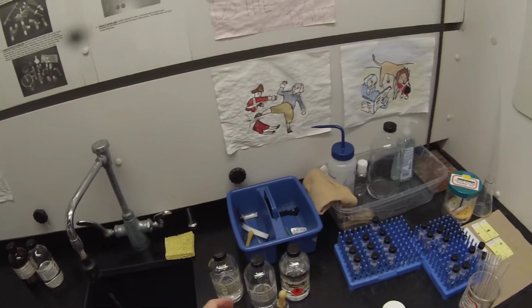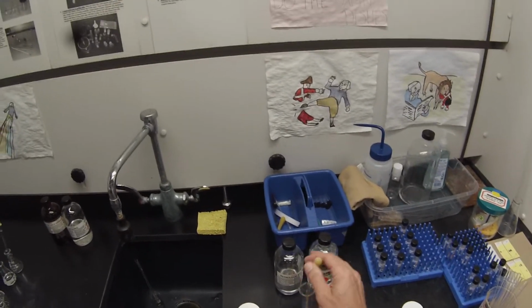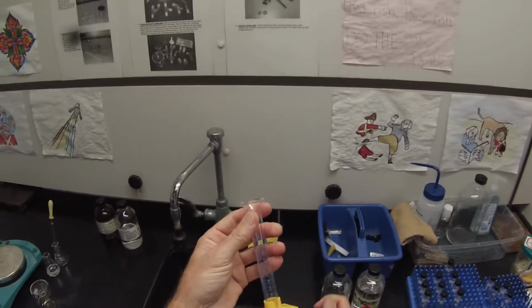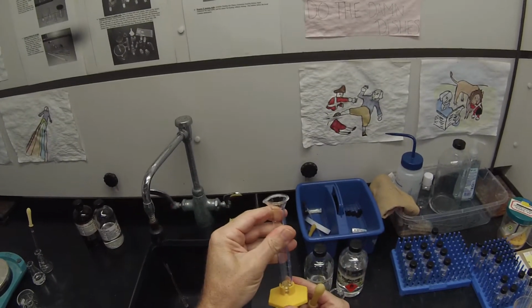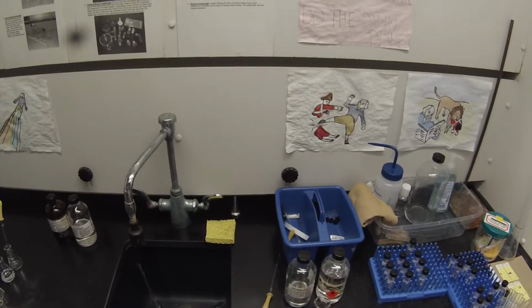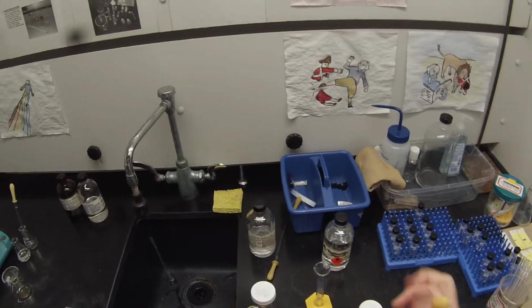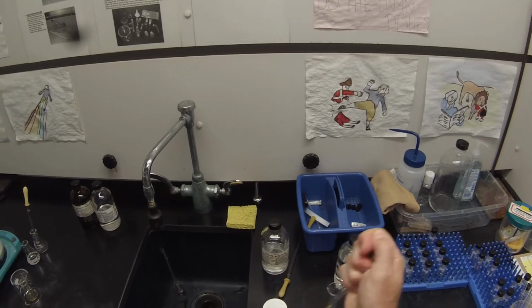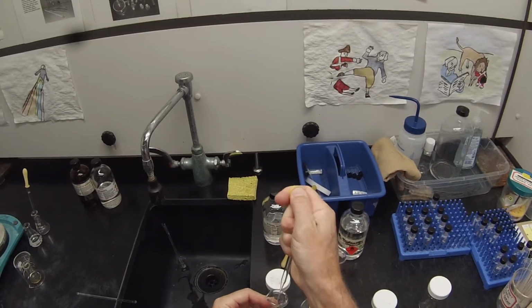It's been reported in the literature that a 10-to-1 mixture of petroleum ether to ethyl acetate works well for cinnamic acid. So if a 10-to-1 mixture works well for petroleum ether and cinnamic acid for a chromatography column, I think maybe a 7-to-1 mixture would be good for TLC. So we're going to add a milliliter of ethyl acetate. And to that we'll add 7 milliliters of petroleum ether. Make that up to the 8 milliliter mark. And we'll need about half of this for our chamber.